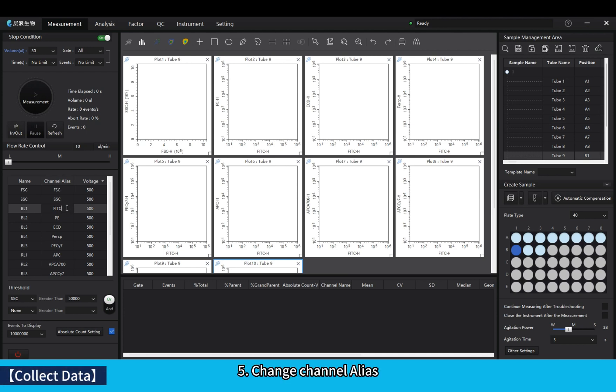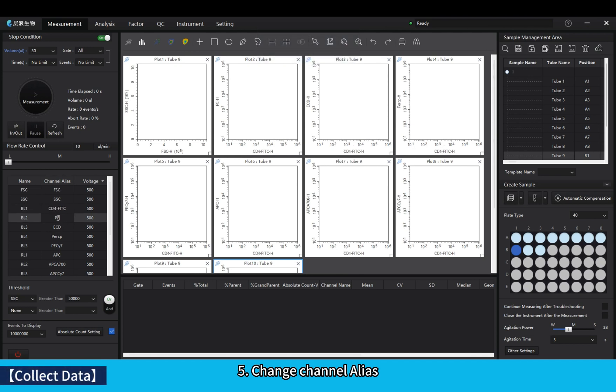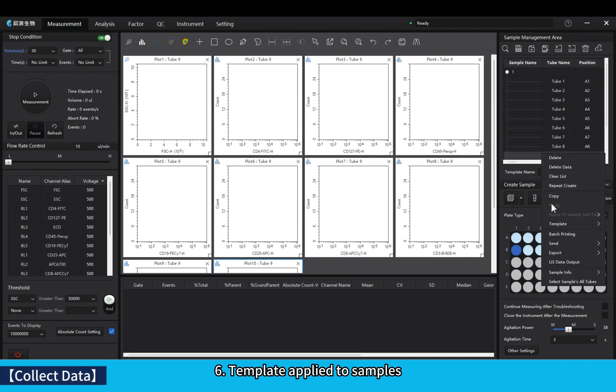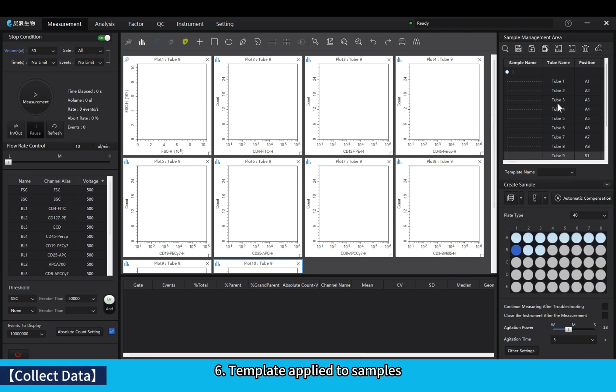Change channel alias. Template applied to samples.